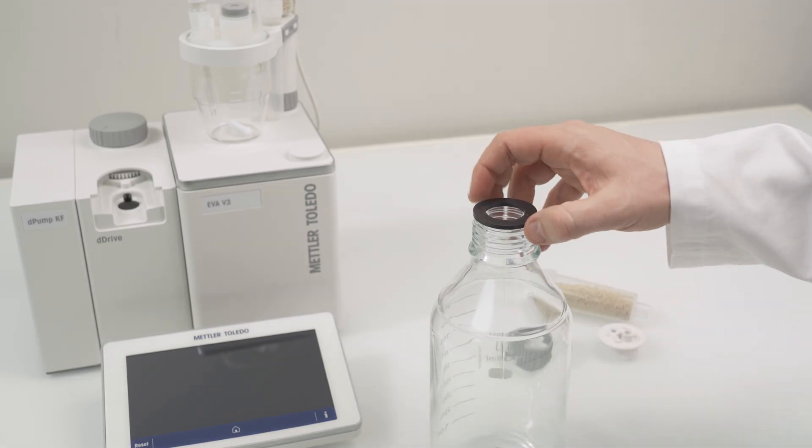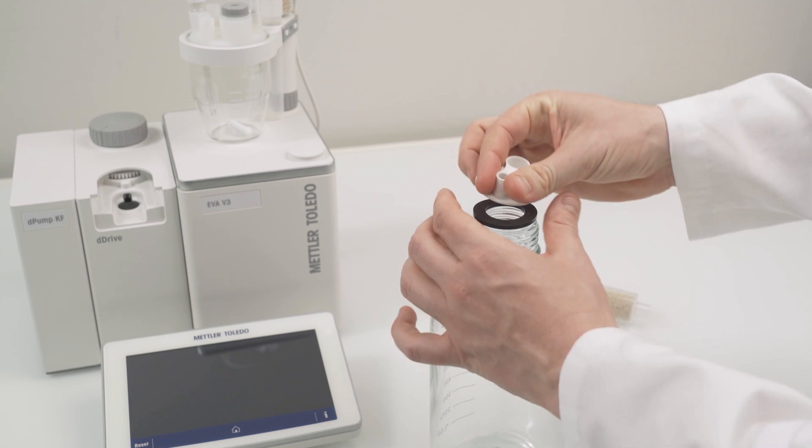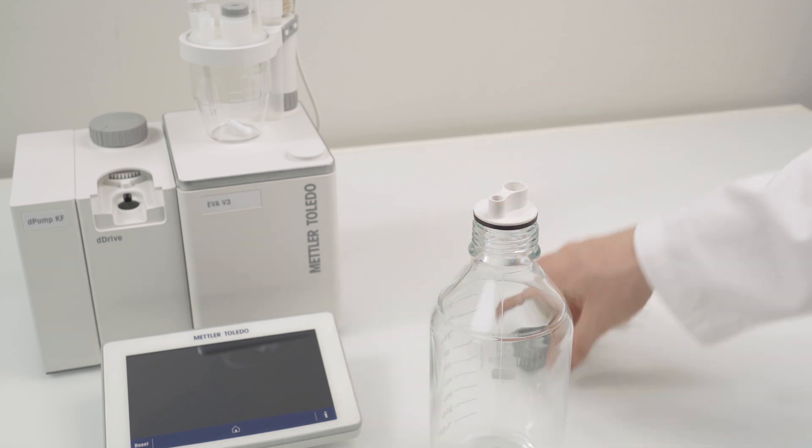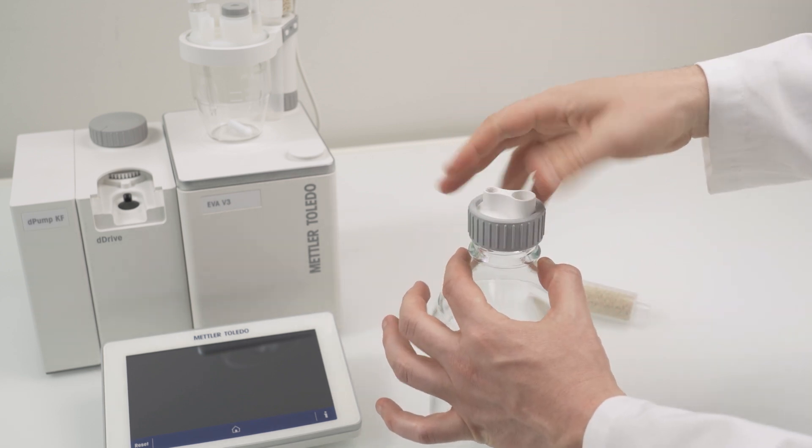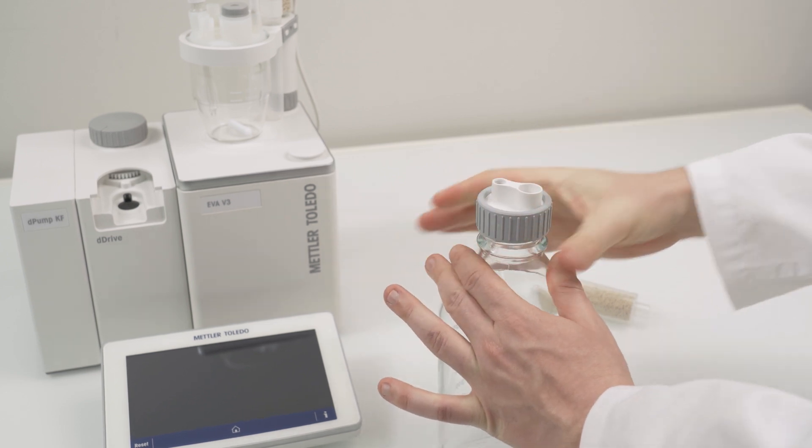Let's continue with the waste bottle of the D-Pump KF. Put the flat seal down onto the bottle, put the adapter on top and fix it with the nut. Connect the drying tube to protect the system against humidity.